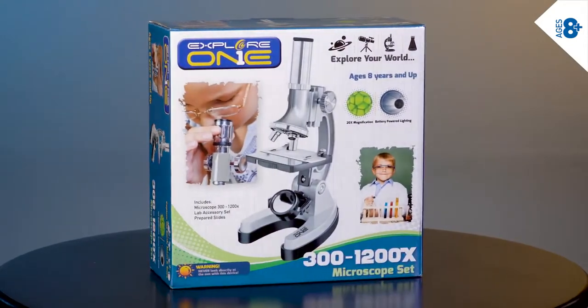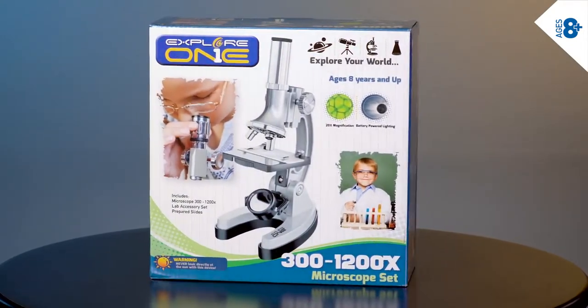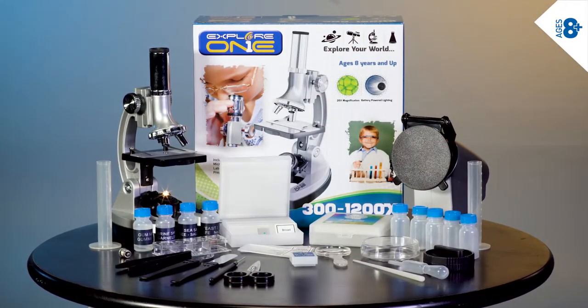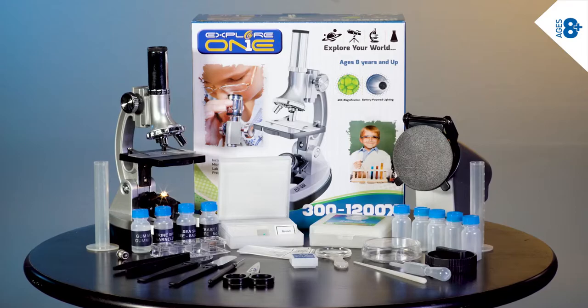The Xplore 1 1200x microscope offers an impressive magnification range from 300 to 1200x and gives young scientists the tools they need to reveal the hidden details of their world.